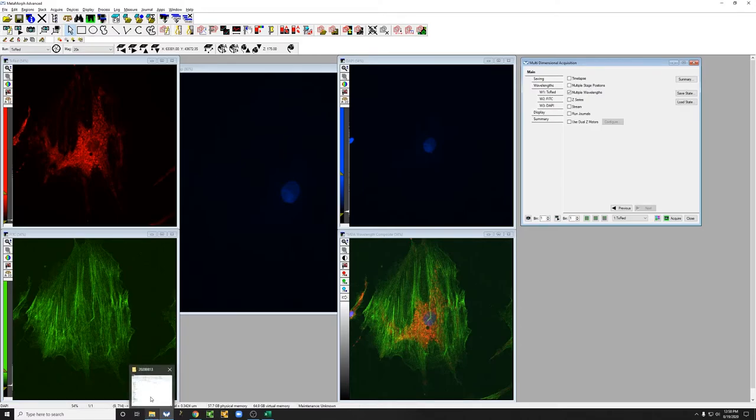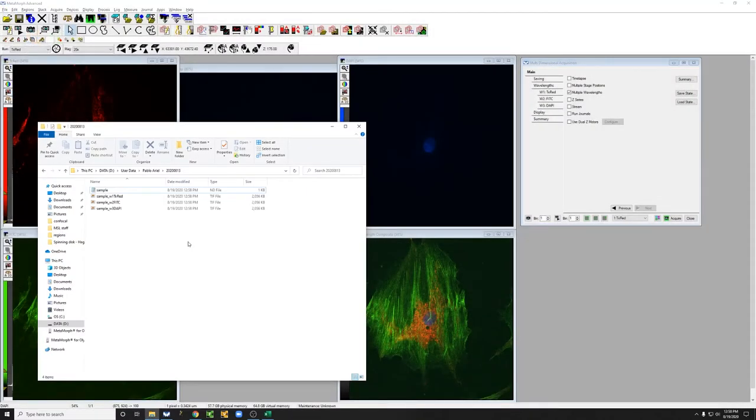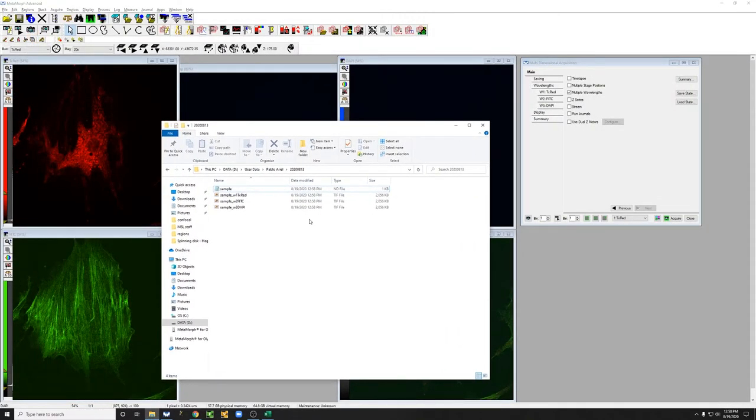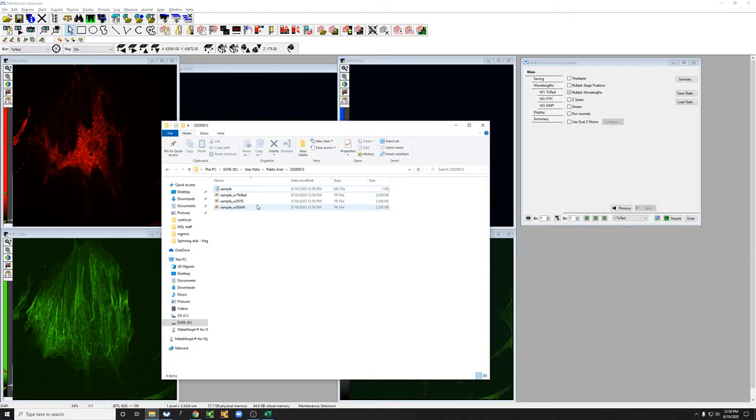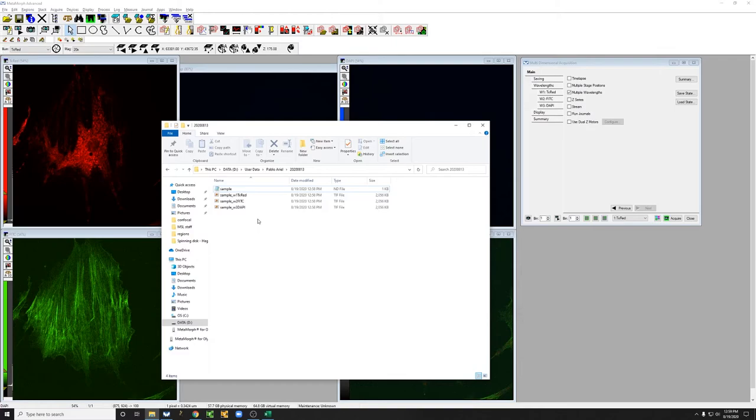These images are in the location where we told them to go, and there is basically one file per channel, per position, and per time point. So we just have one position, one time point, three channels, so here are the three images.